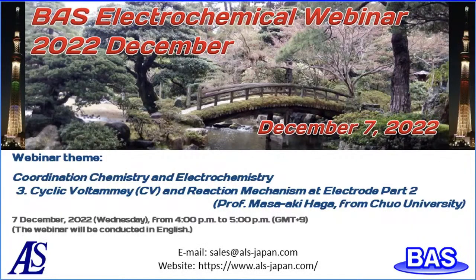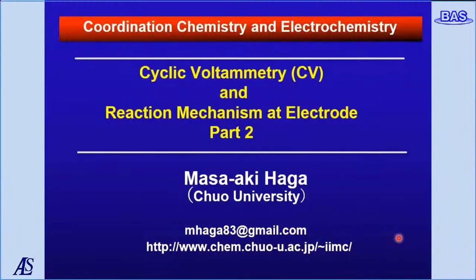Good afternoon. This is Masa-aki Haga of this lecture. This is the third lecture on cyclic voltammogram and electrochemical reaction mechanism at the electrode. Today, I deal with more complicated electrode reactions, such as ECE or ECEC mechanism, and also electrocatalyst at the electrode.